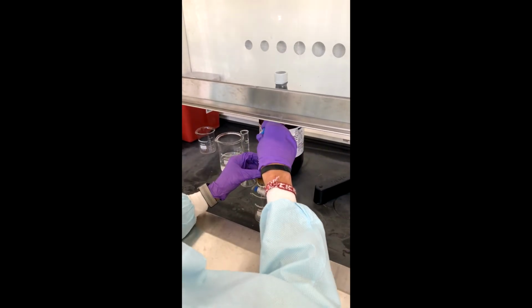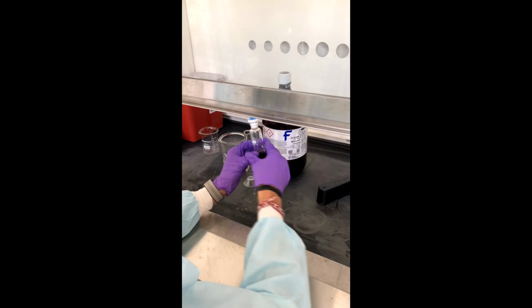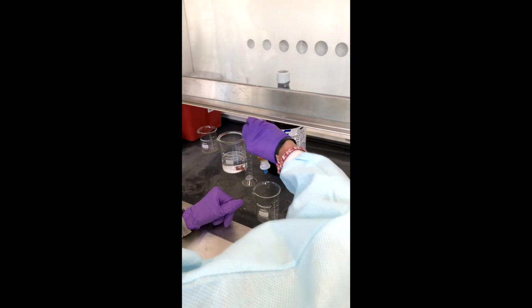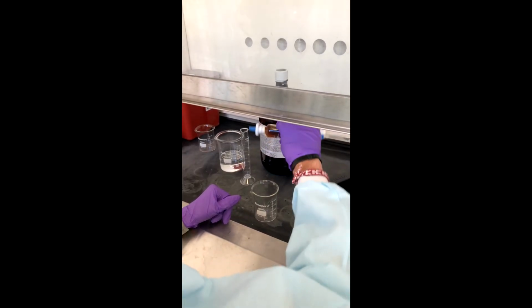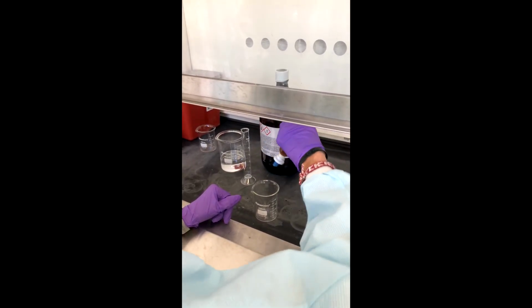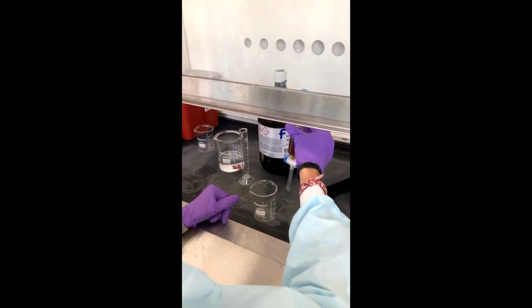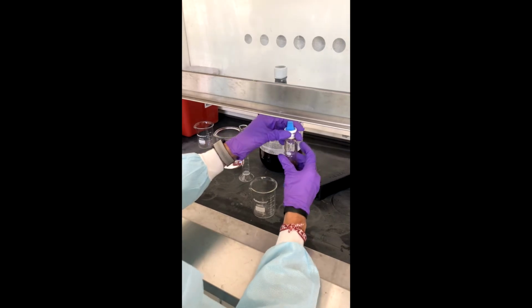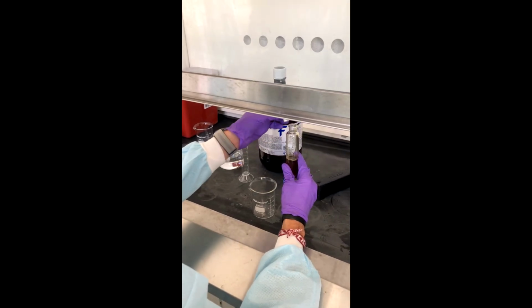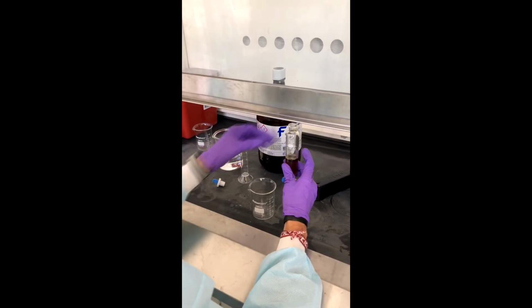And once that is all out, you will turn the knob, allowing the rest of the water to remain in, repeating this step 3 times total to make sure all of the caffeine is extracted out of the water and is in the dichloromethane. Once all of the caffeine is in the dichloromethane, we can take that, put it into the spectrophotometer, and get an appropriate reading that will be put into our calibration curve to get the final concentration.